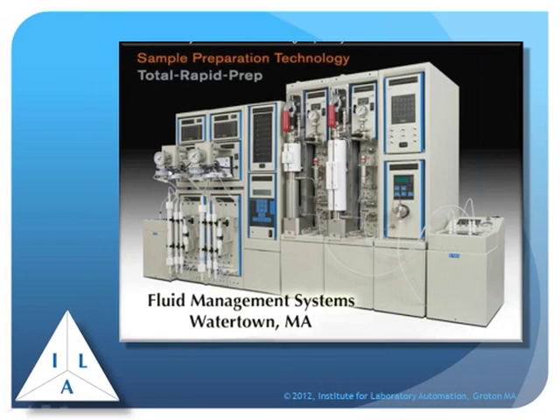We also looked at this system last week as an example of the kind of equipment that's being used for doing PCB analysis in food products. Basically, it's a small chemical engineering system that processes the sample and gives you the results.